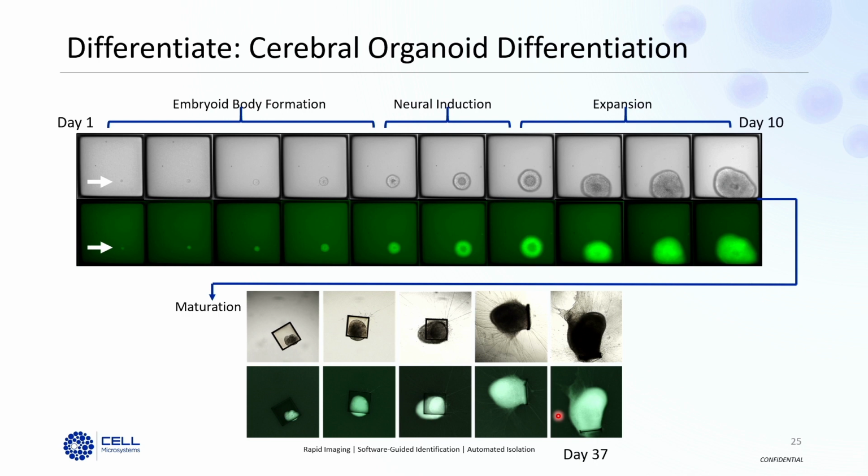That depends on organoid type. For the adult stem cell derived organoids we're usually using some combination of TrypLE, sometimes with DNase-1 just to continue to encourage those cells to get into single cell suspension. It can be difficult, and some organoids are inherently stickier than others. But again, to reiterate, part of the beauty of the imaging and the array technology is that you're very easily able to identify rafts that have a single cell versus rafts that have 2 cells stuck together, right? And so, the dissociation upstream can take a little bit of tweaking depending on your organoid type, but that's an upstream optimization to moving to the array.